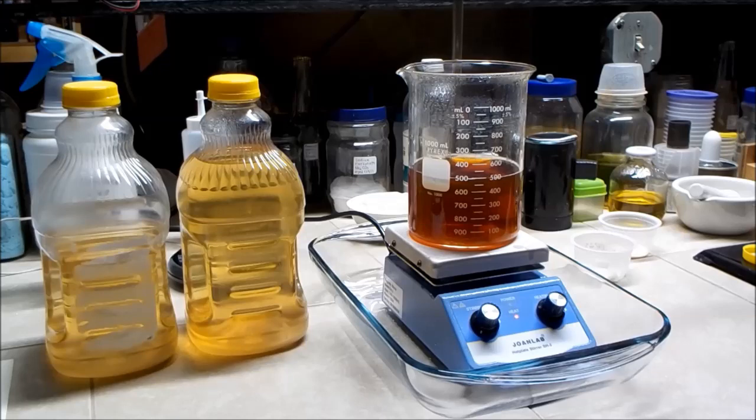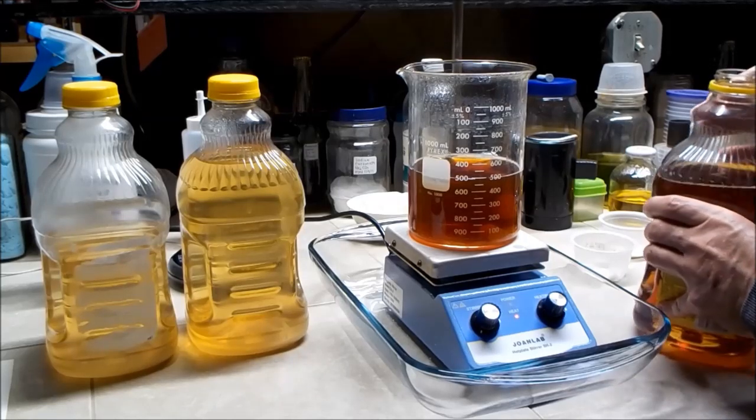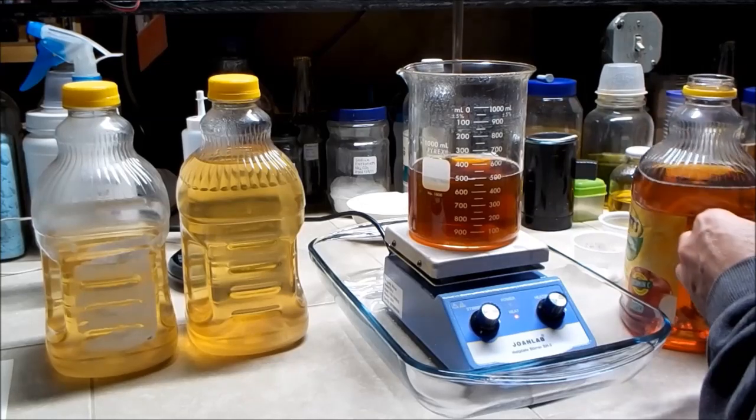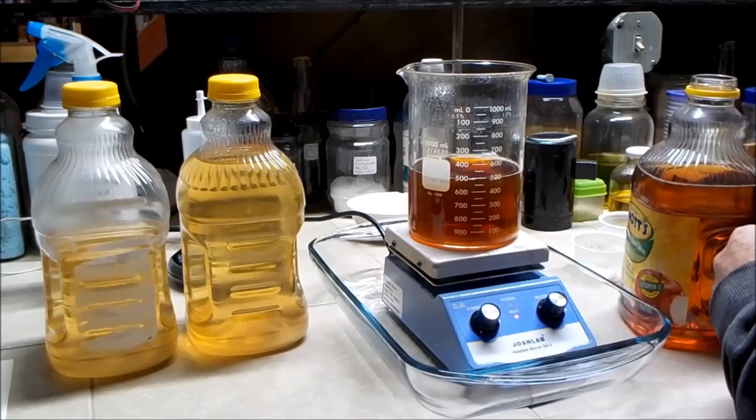The volume is reduced down to about 500 milliliters, which is about half. I've also added a few quartz chips to act as boiling stones to prevent any bumping. I'm going to go ahead and top that off again and bring the volume back up to one liter, then I'll continue reducing it.